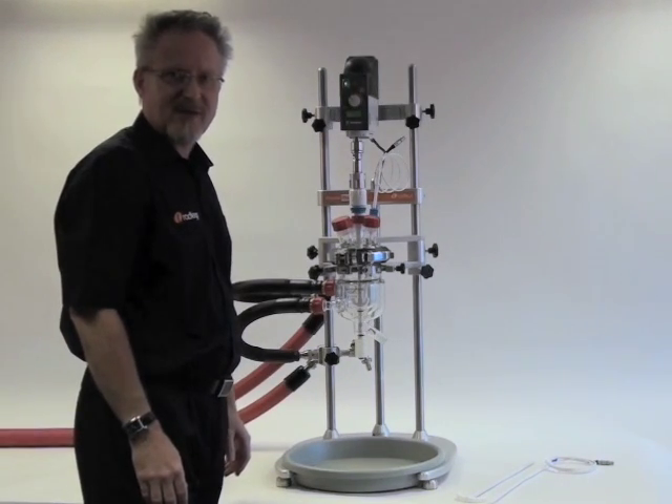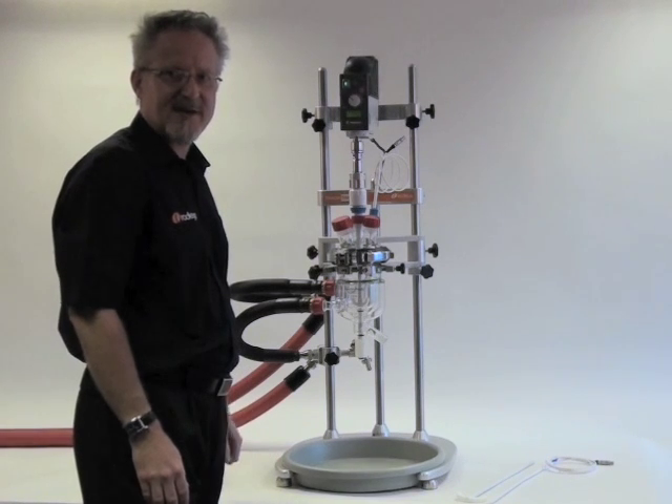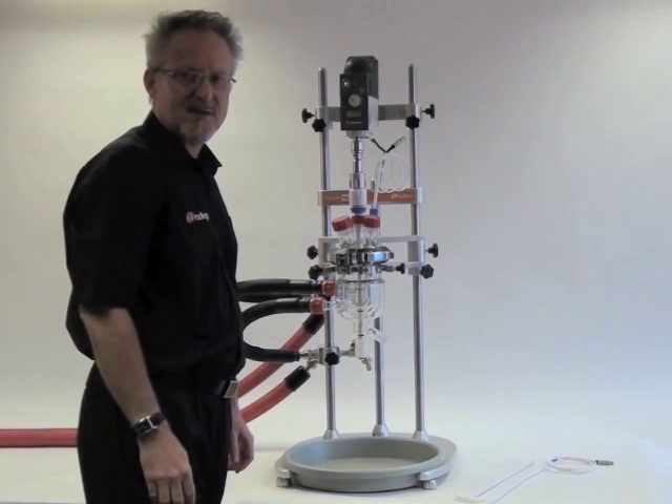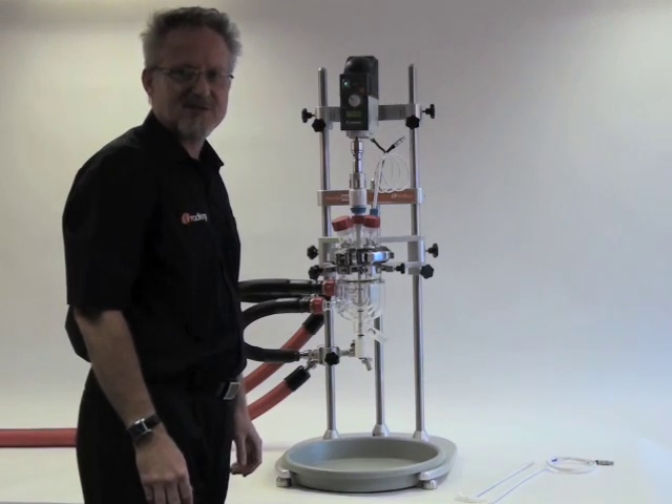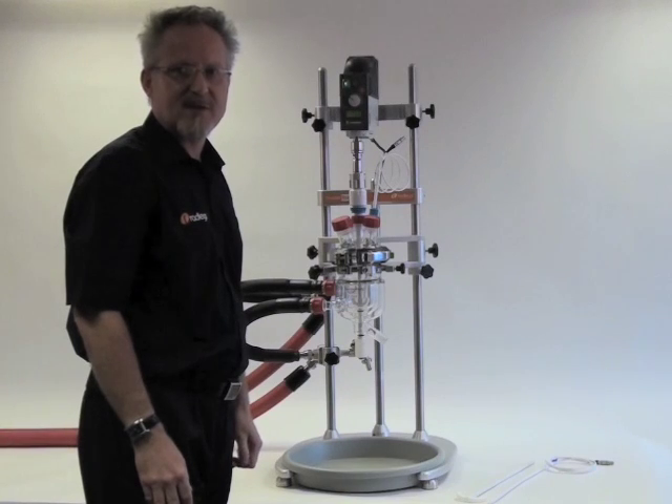Hello, my name is Ed Hartley. I'm Product Manager for Radleys and I'd like to show you today our new product, Reactor Ready, which is an innovative, patented, low-cost reactor workstation for jacketed glass reactors from 250ml to 5L.